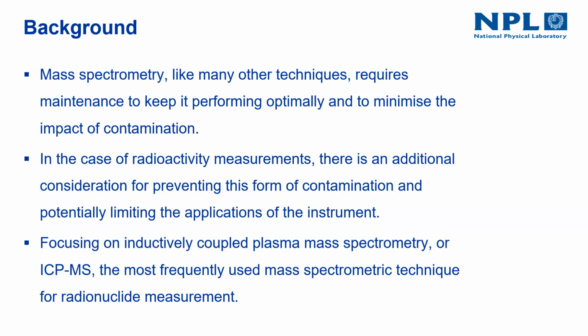UK. As with a number of analytical techniques, mass spectrometry requires routine maintenance to keep it performing at the optimal level and to minimise the extent and impact of contamination that would otherwise limit the applications of the instrument. When it comes to radioactivity measurement, this form of contamination presents an additional consideration for the user, both in terms of the applications of the instrument and from a safety aspect for the user.